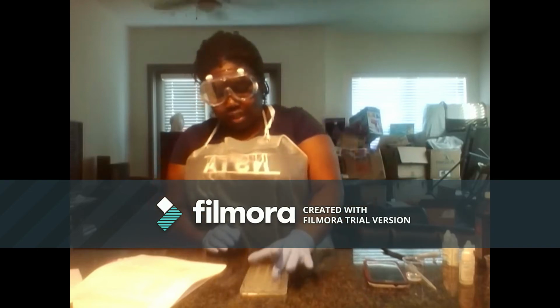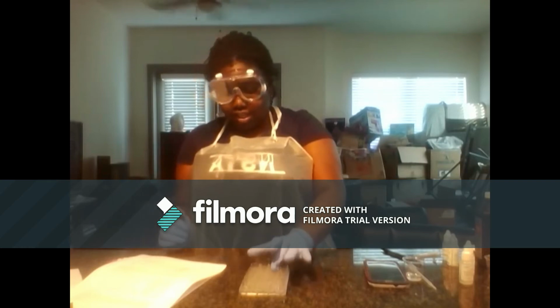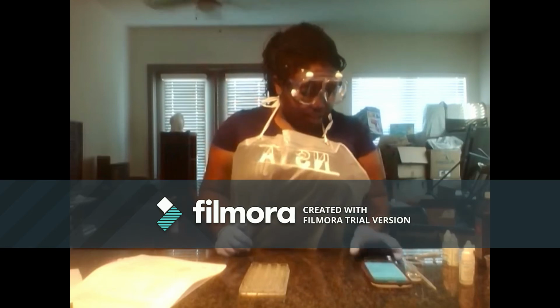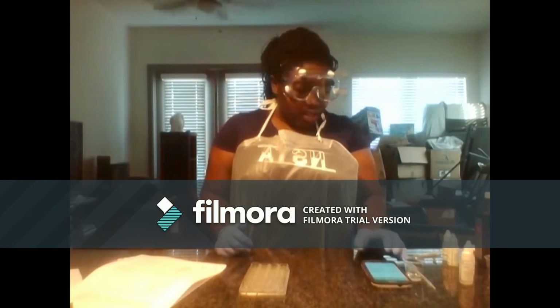And I've prepared my 3 and 4 with their respective amounts of solutions, and 5 and 6, and 7 and 8. Okay, just because I'm running out of time on this video. So I went ahead and prepared them, and I will add the different amounts of hydrogen peroxide to start my experiments.